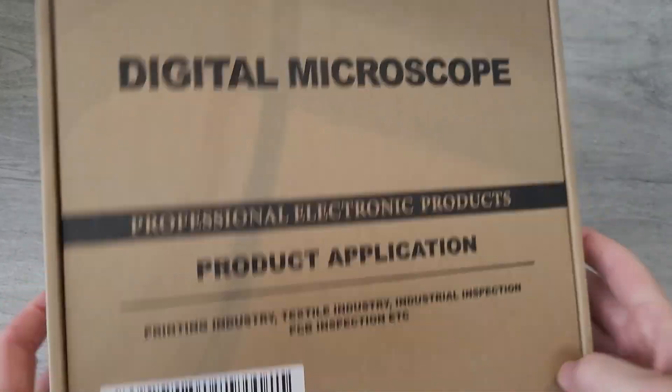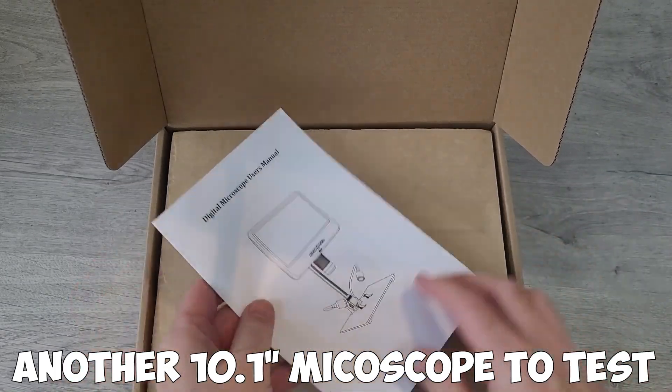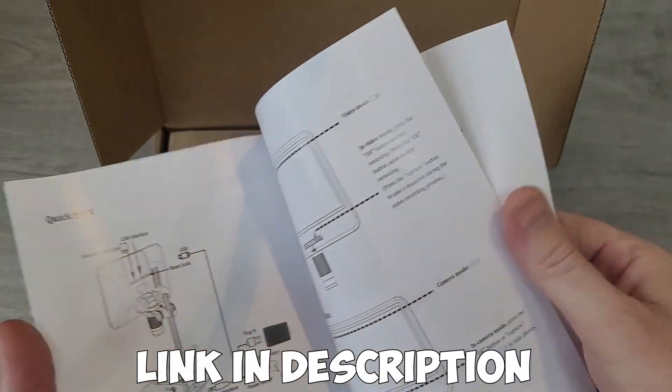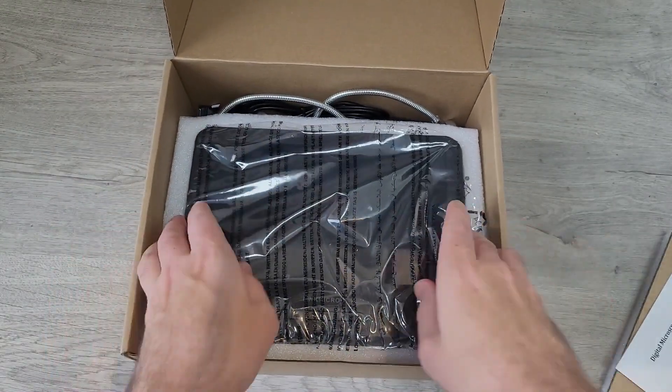Welcome to this week's video. This week I'm reviewing a Link micro 10.1 inch microscope. It comes in a nice protective box and includes a basic instruction manual to get you going.